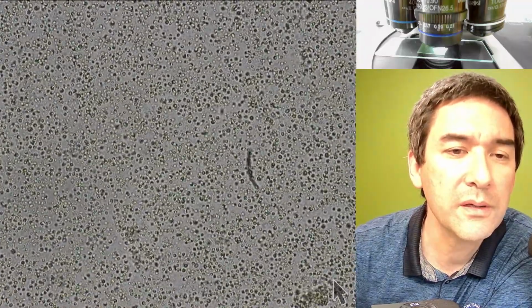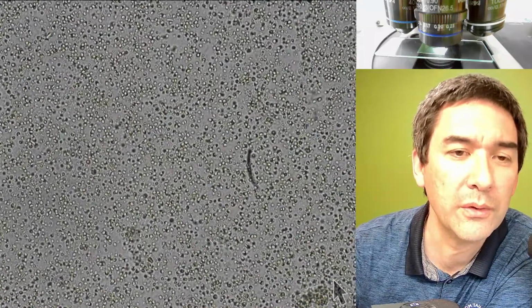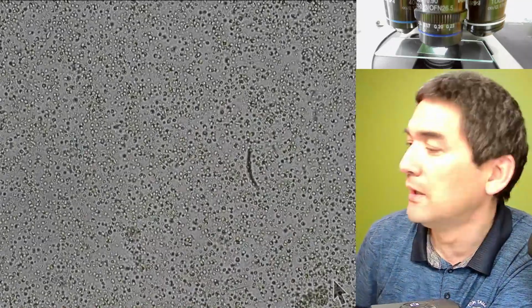Look at this. I don't know. This is not Brownian motion. They are actually moving on their own. It seems to be a combination of Brownian motion. Look, there is some. Okay, this is 60.